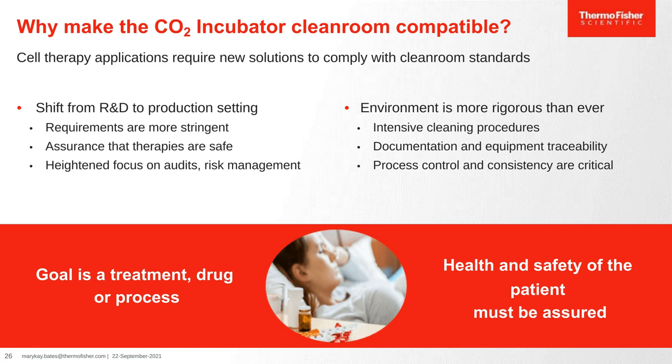Also, in the clean room, because the environment is so rigorous, there's an intensive focus on cleaning procedures. I think about this a lot in my job at this point. Documentation is required, equipment traceability, process control, and consistency across those processes, across different lots are critical. And all of this is because the end goal in this production is a treatment, a drug, or a process that will be used in a human patient whose health and safety must be assured.